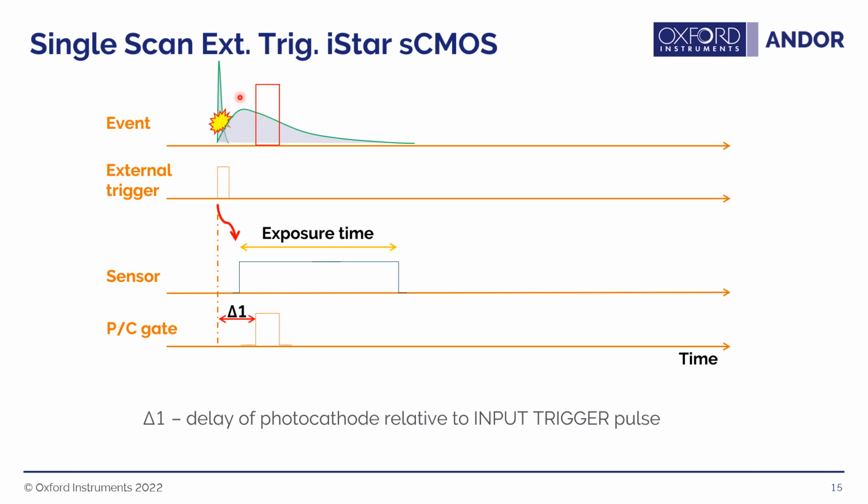Overall, we want to make sure we're not acquiring excessive other signals that we don't want in the camera, and we want just long enough exposures and gating to acquire the signal we're looking at, so as not to create too much dark count during the acquisition.